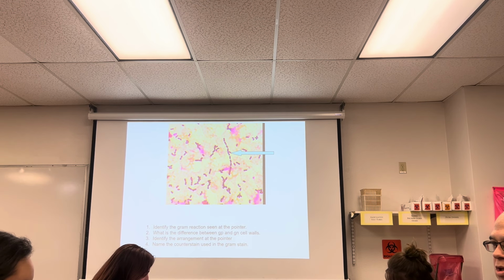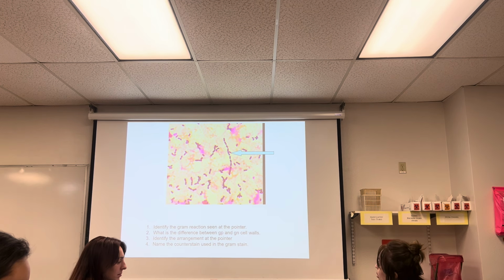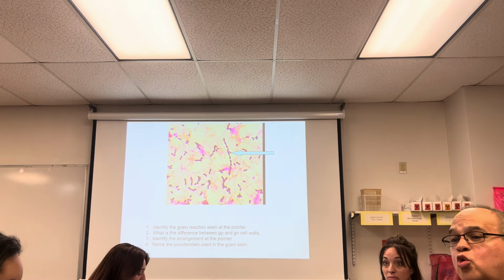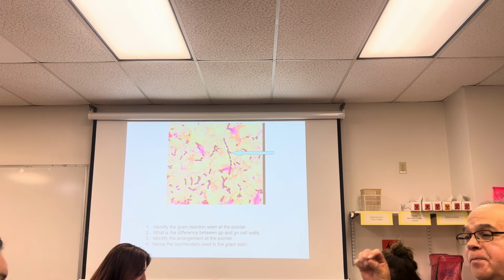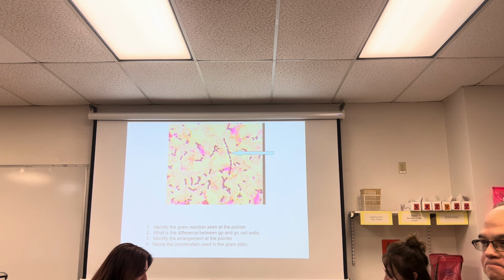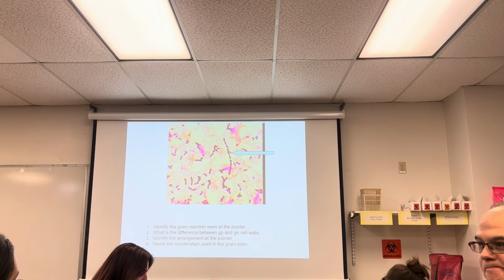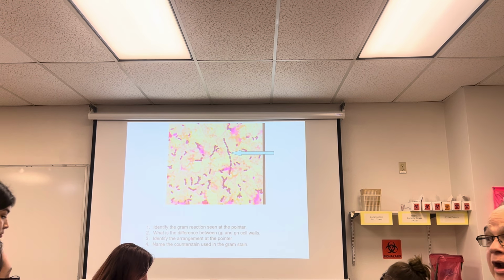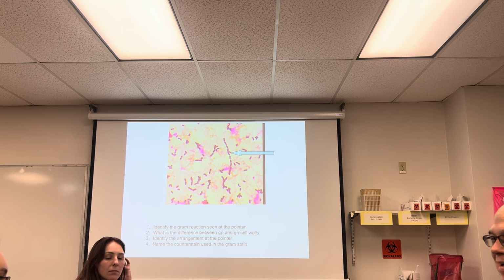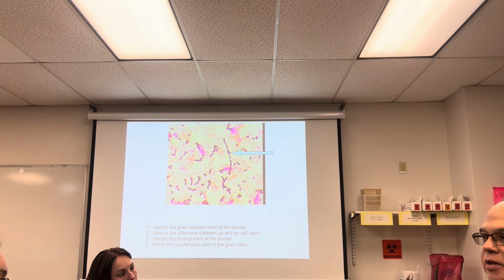Okay? So now, if we know this is a gram stain, what is the gram reaction at the pointer? Gram positive. You can say gram positive, or you can put GP, but you cannot put gram with a plus sign. That's not acceptable. It's not what is found in science.